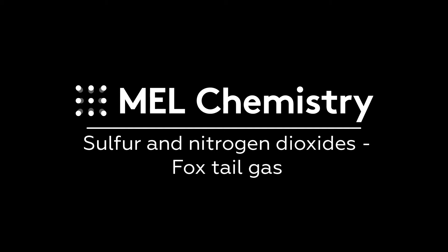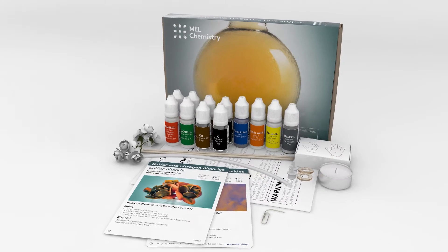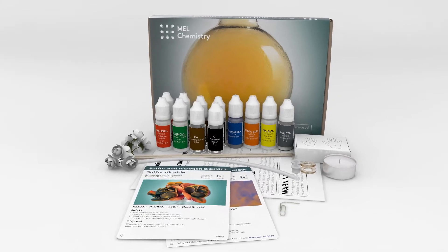Welcome to the wonderful world of chemistry. Today, with the Sulfur and Nitrogen Dioxide set by MEL Chemistry, we will synthesize nitrogen dioxide and then observe how this reddish-brown gas is absorbed by activated carbon.